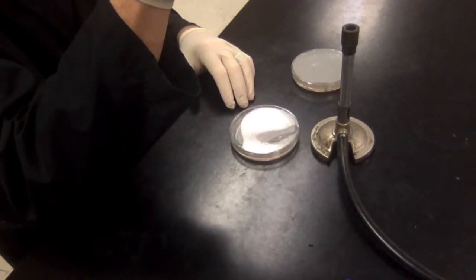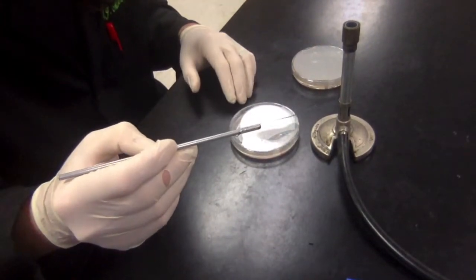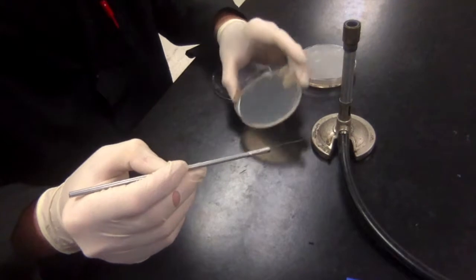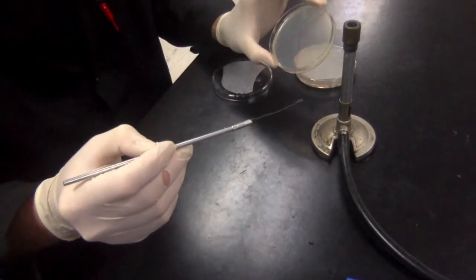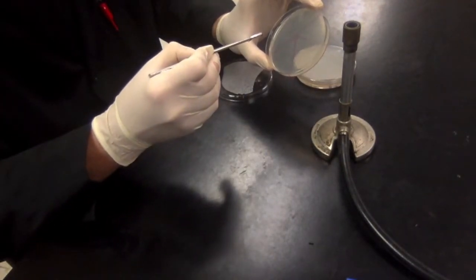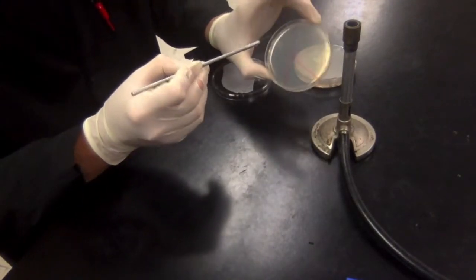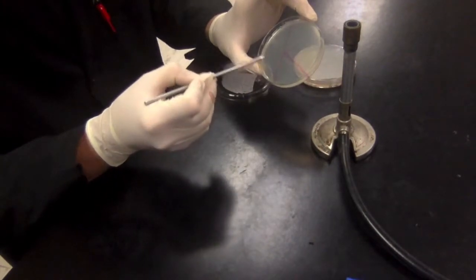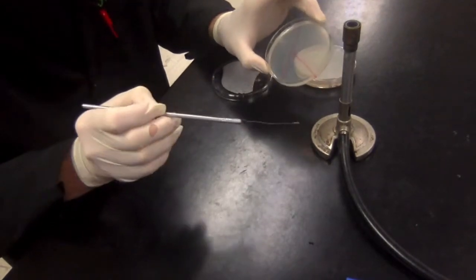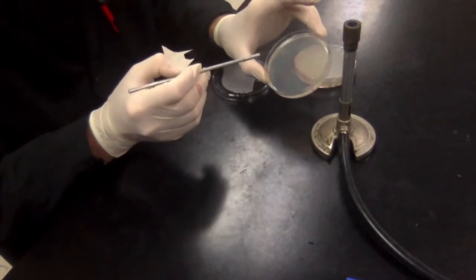Now I'm going to reflame the loop — heat it up again until it's red hot — which kills off all the bacteria that were already on there. I'll give it another ten seconds to cool off. Then I'll streak from the first quadrant into the top part of the K with just one streak, and color in that whole quadrant as well, being careful not to go into any other quadrants. Essentially what I've done is diluted that first streak — there are a lot of bacteria in the first quadrant and I've pulled just a few of them into the next one.